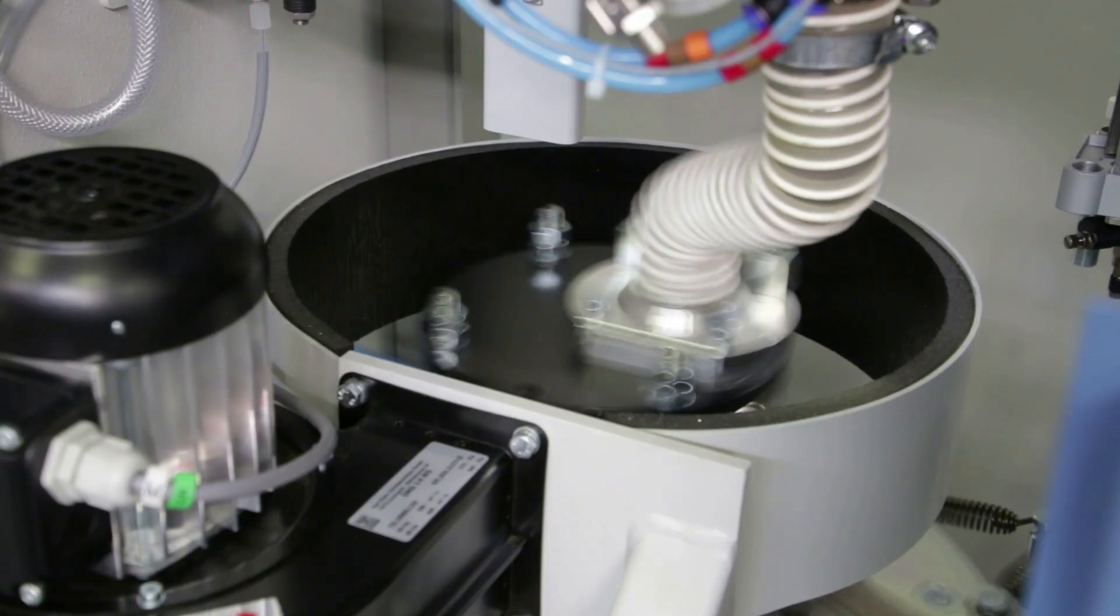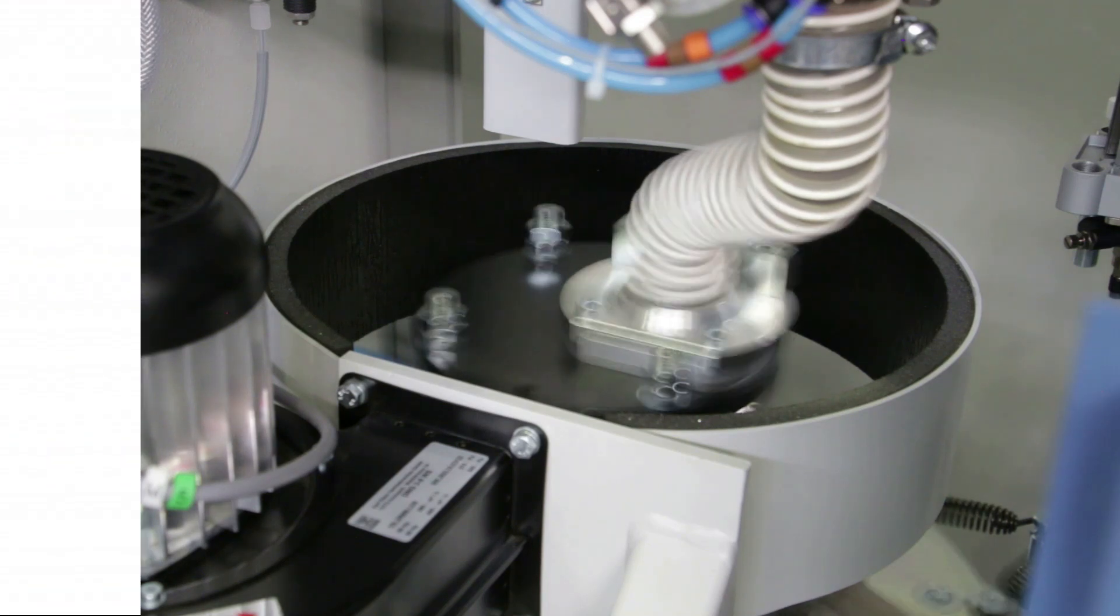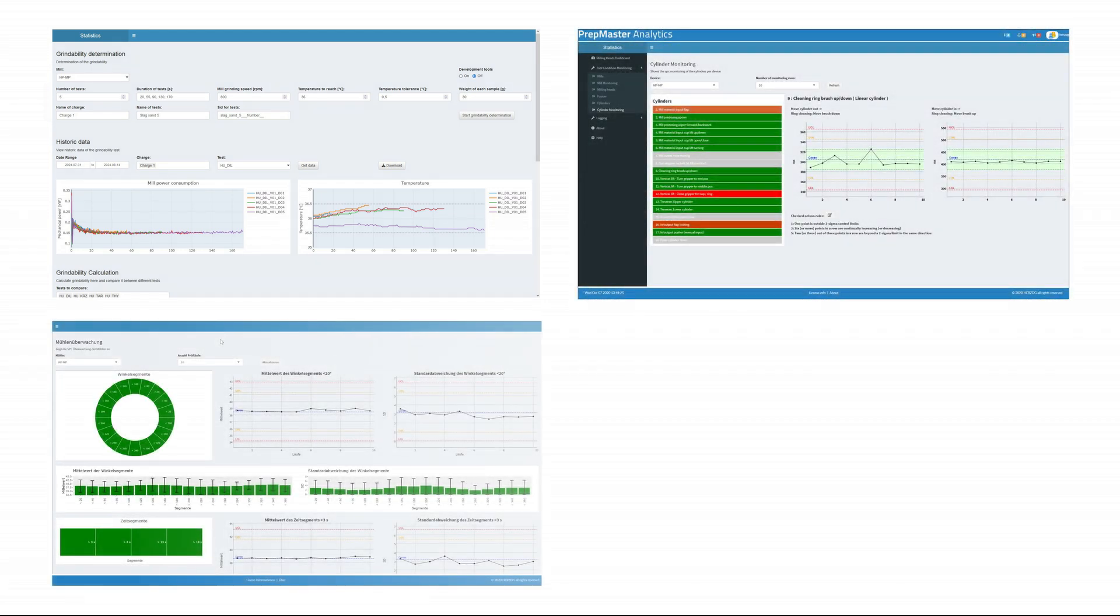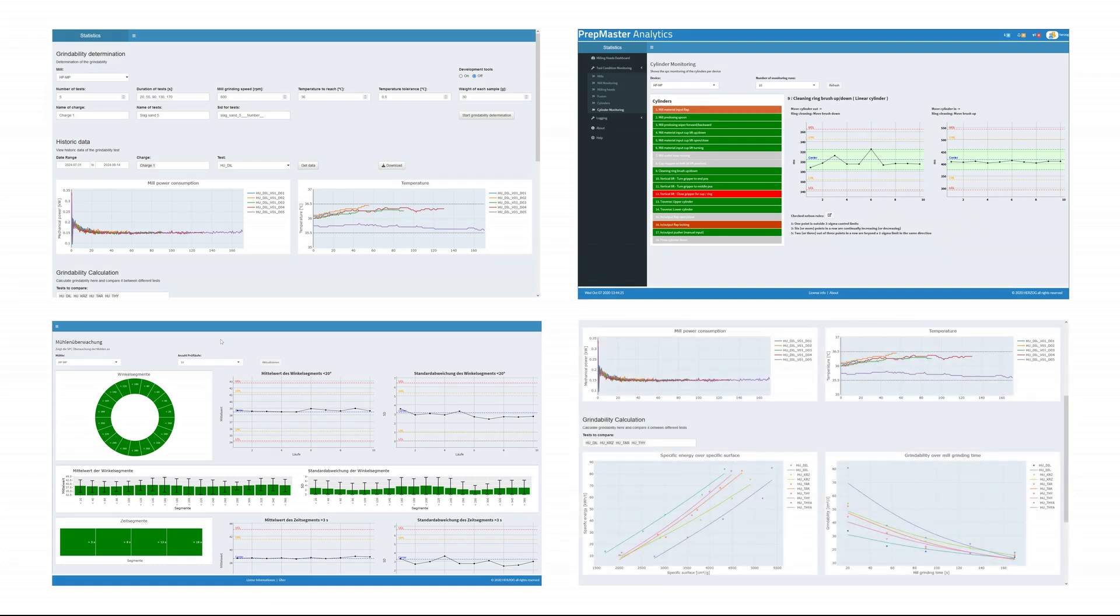All parameters of the HPMP are monitored fully automatically using our PrepMaster analytics software. This not only enables true predictive maintenance, but also easy optimization of preparation parameters and determination of the sample grindability.